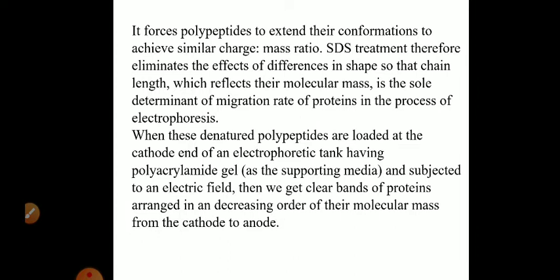SDS also performs one important work. It forces the polypeptide to extend their conformations to achieve similar charge to mass ratio. So, charge to mass ratio is the same. SDS treatment therefore eliminates the effect of difference in shape so that the whole proteins get separated, or migrate, only on the basis of their molecular mass. Right. So, molecular mass is the sole determinant of migration of proteins during electrophoresis.